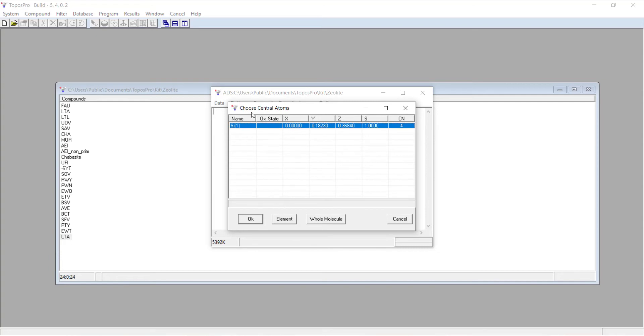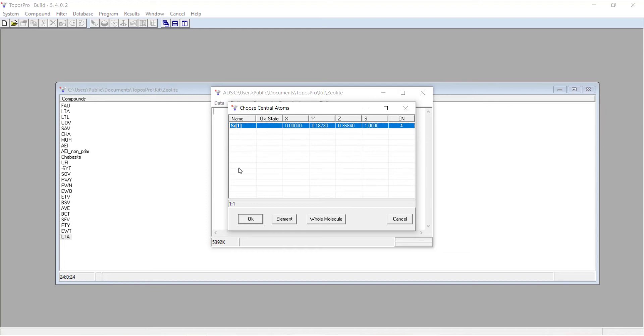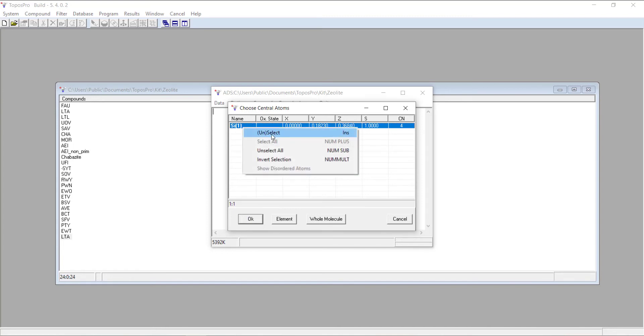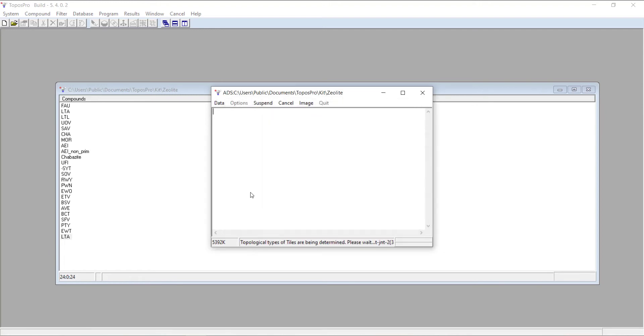Then you get to this page which says choose your central atoms, similar to what you did for the simplified net before. Silicon is going to be our central atom. If you add aluminum, you can pick that as well, but we've only got silicon. Or if you have multiple silicons, you want to select all of those. You can either right-click and say select, or you can press insert on your keyboard, or you can press plus on your number pad to select everything.